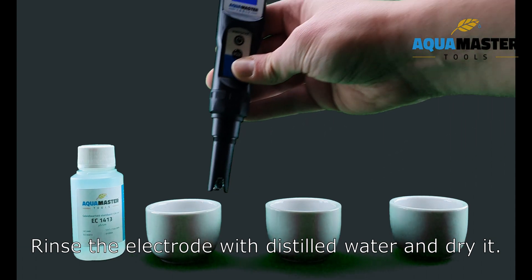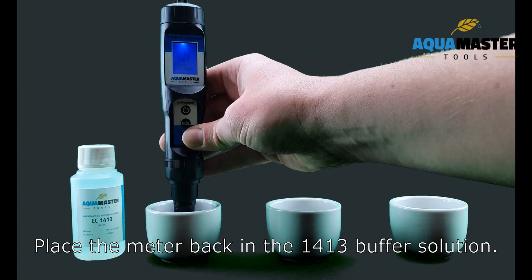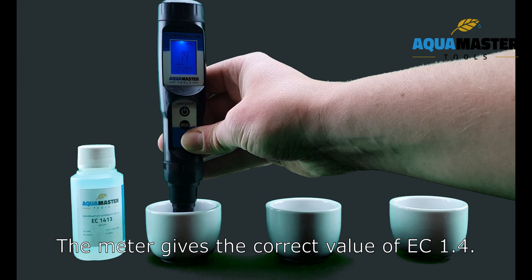Rinse the electrode with distilled water and dry it. Place the meter back in the EC1413 buffer solution. The meter gives the correct value of EC1.4.